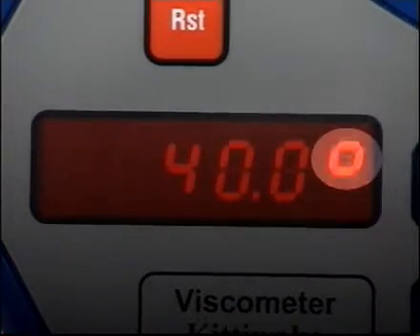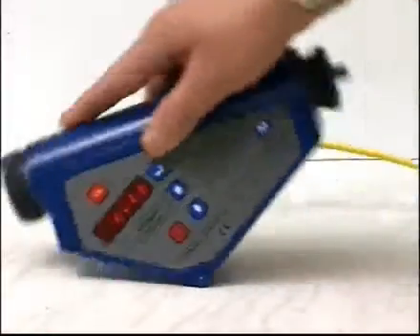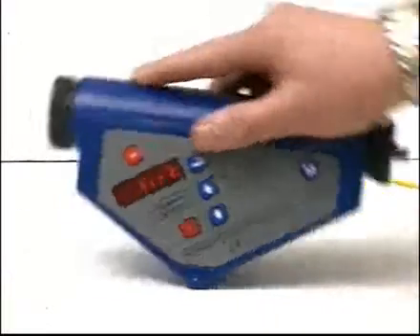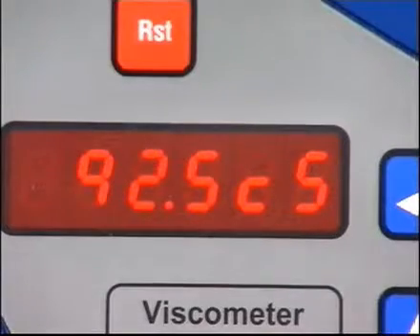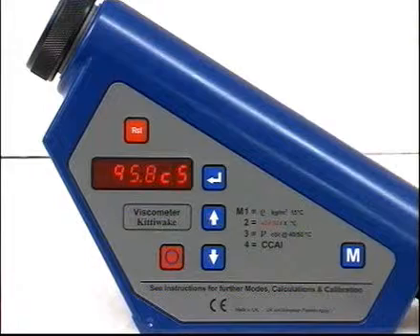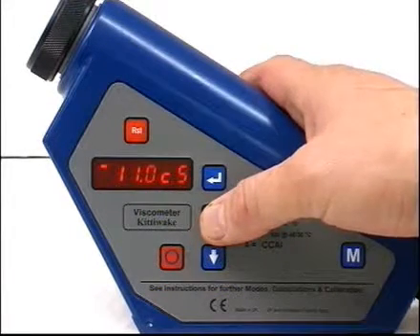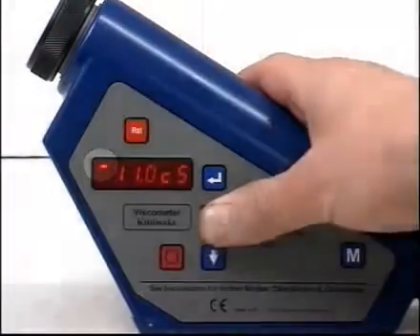Only tilt the viscometer when prompted. Now the display shows the viscosity. Wait for further tilt prompts before taking repeat readings. Use the arrow keys again to get a display of centistokes at 100 degrees Celsius if required. This is indicated by the small dash on the display.